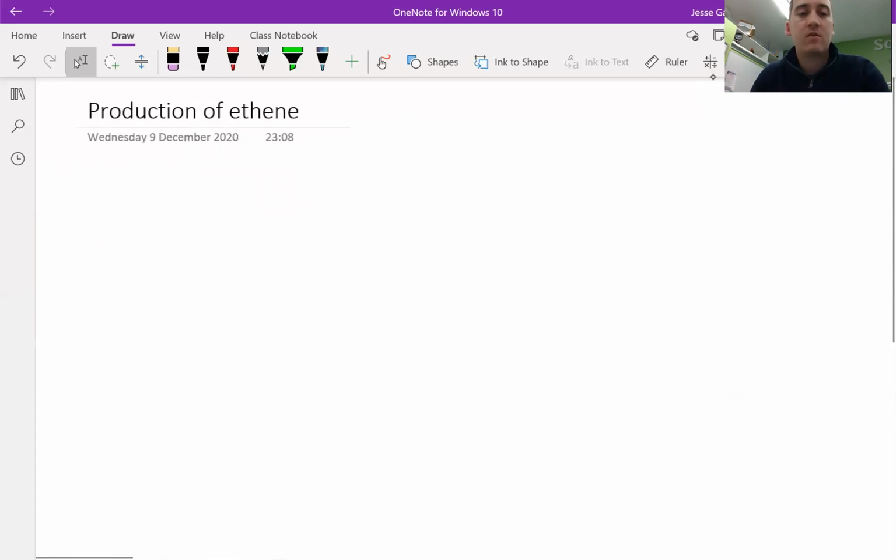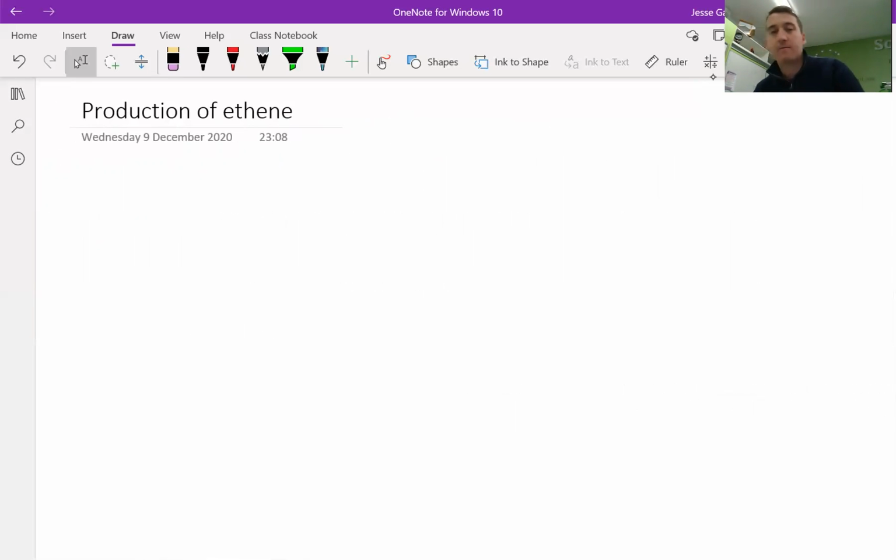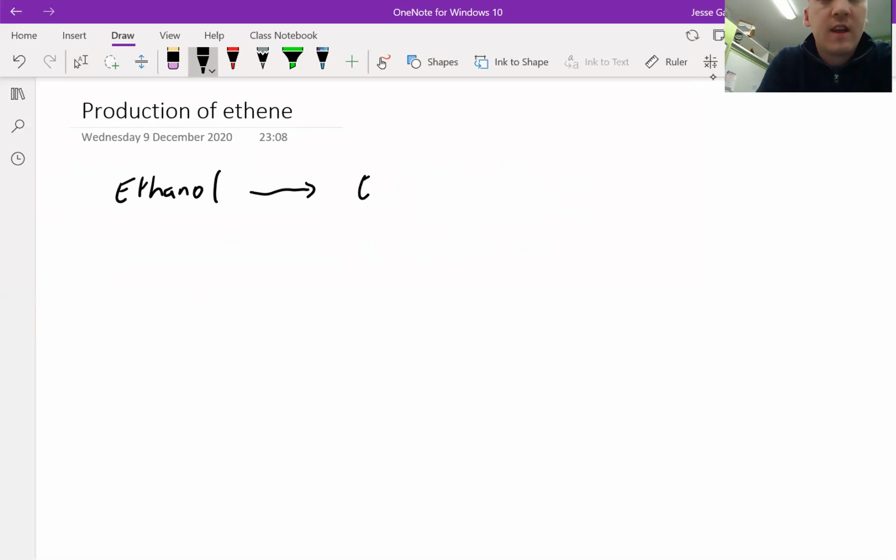So let's go back now to talking about our experiment. Now, in this experiment, we're going to be making ethene, producing ethene. So how are we going to do this? Well, we're going to have to react ethanol. Ethanol is an alcohol. With our ethanol, we're going to take it and convert it into ethene.